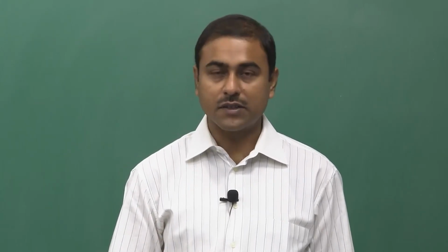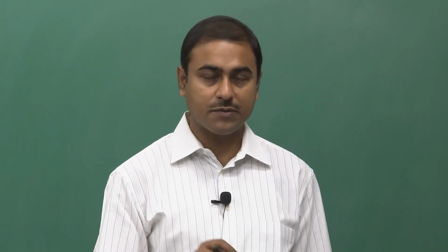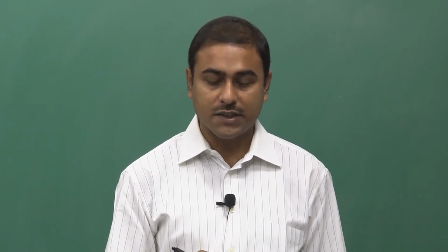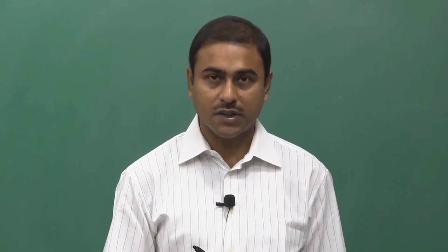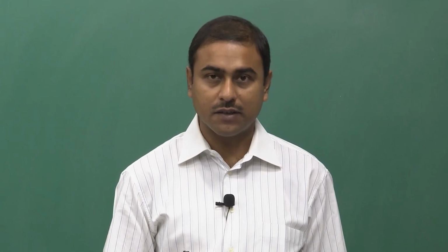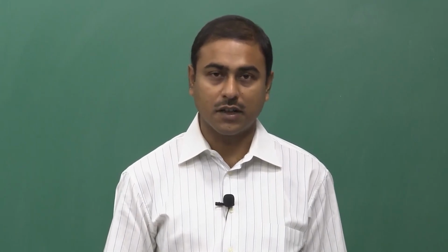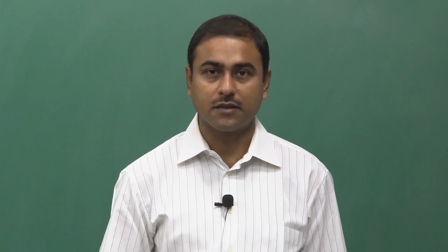So, that is all for this fluorescence upconversion. We have discussed two methods basically, the TCSPC and fluorescence upconversion, and here we will finish our lifetime measurement topic, and we will continue our discussion on other topics from the next class. Thank you very much.